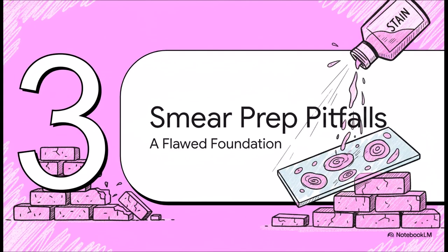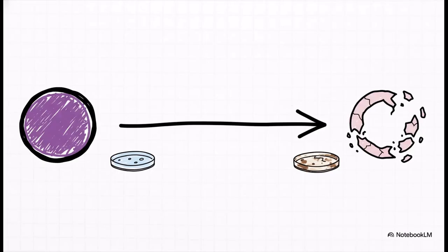You've got to start with a solid foundation. All right, mistake number 3. This is one people sometimes forget about: the age of your bacterial culture. Yeah, it might not seem like a big deal, but for accurate staining, bacteria have a shelf life, especially the gram-positives. Over time, their cell walls just start to, well, fall apart.